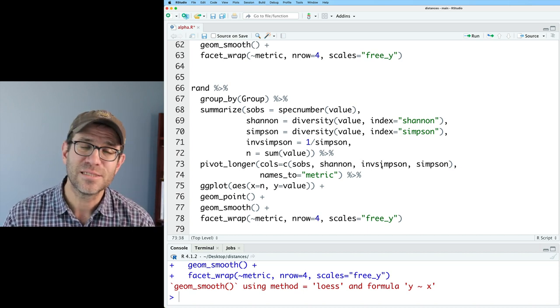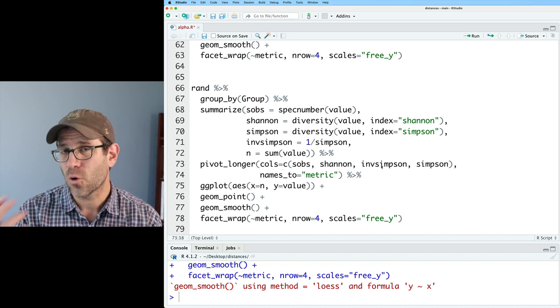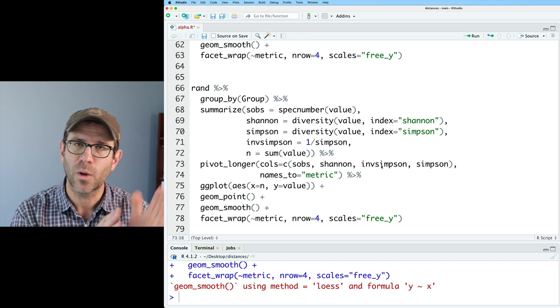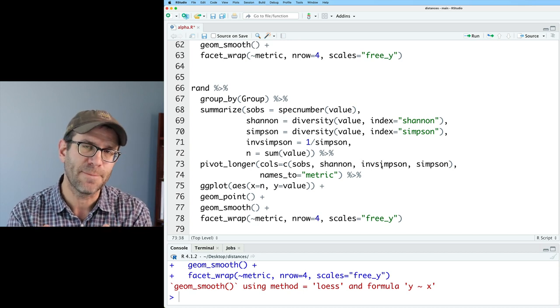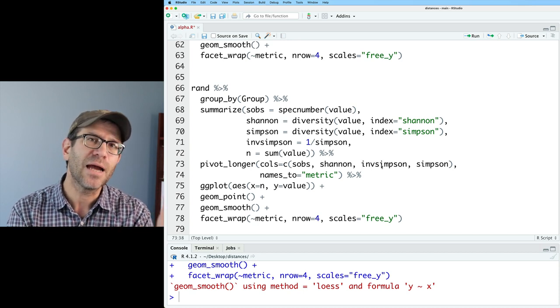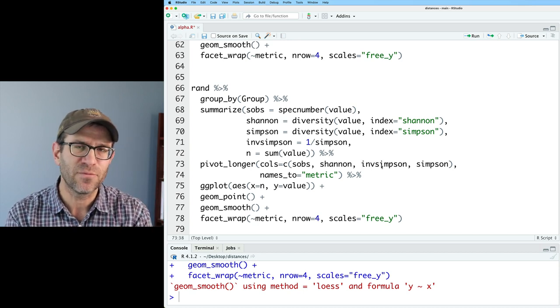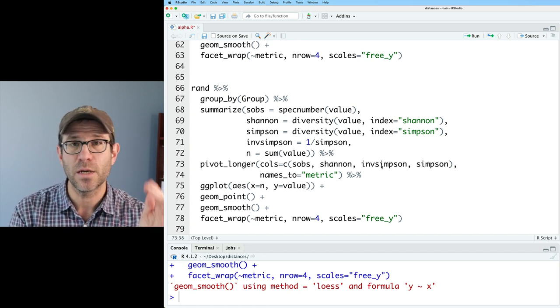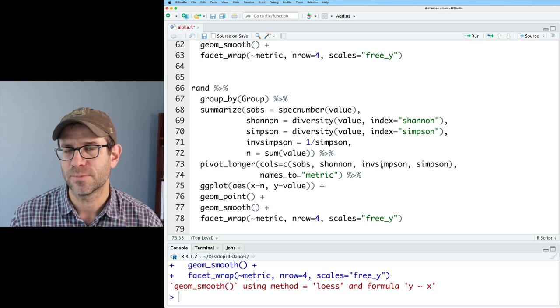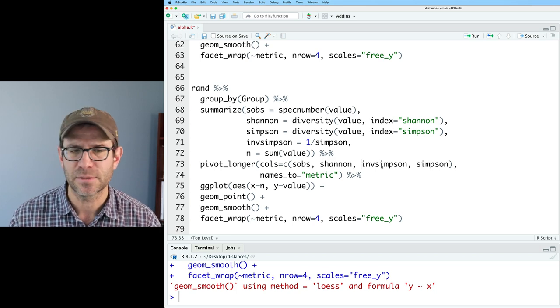So they know if they have a higher diversity, do you then have a lower Simpson or what's going on? Doing one minus Simpson kind of does the same type of thing of one divided by Simpson to get the inverse Simpson does.